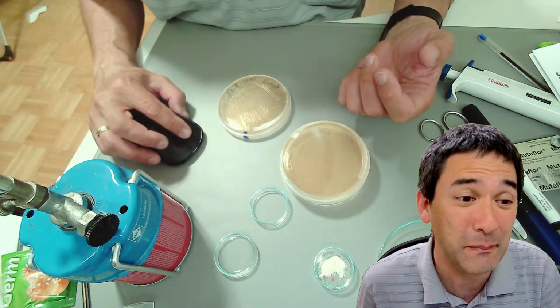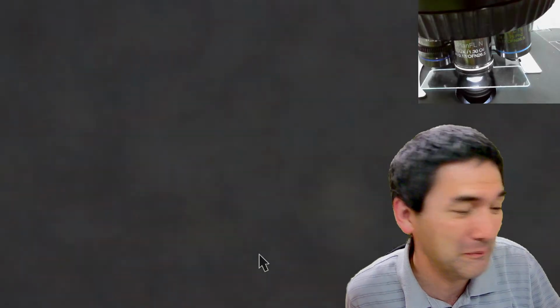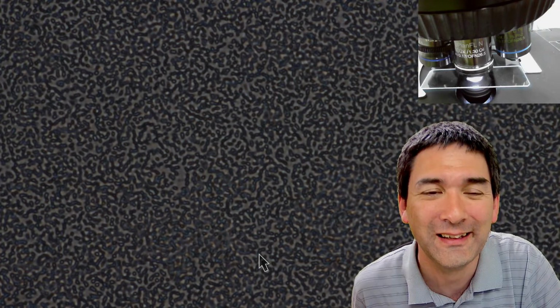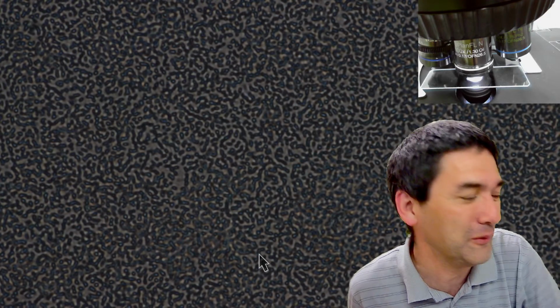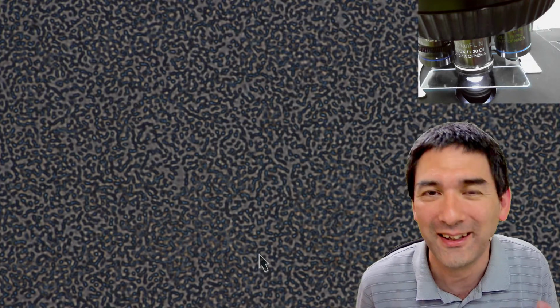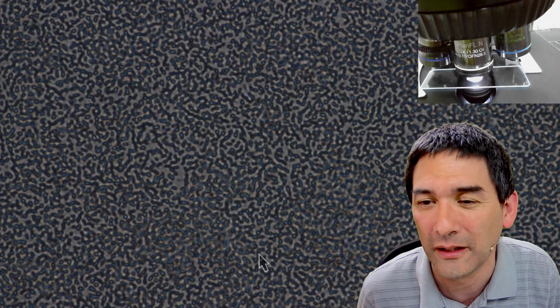I mean, look, you're just dots, right? Let's go up a little bit with the magnification. I mean, yeah, that's not so super exciting. Yeah, okay, it's interesting to see them once, but honestly, that's the reason why I said there are probably more interesting things to look at.